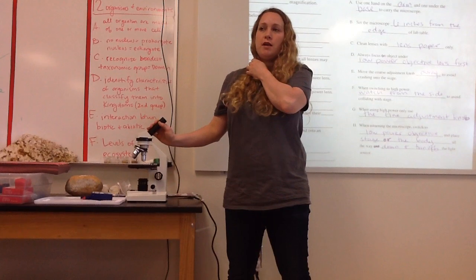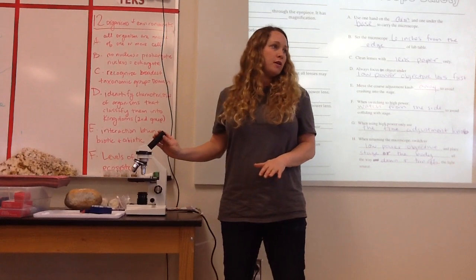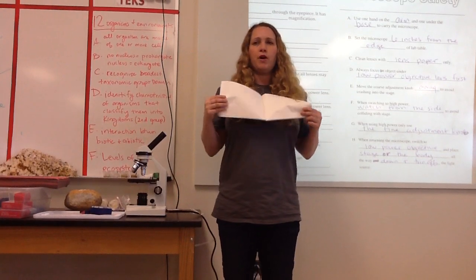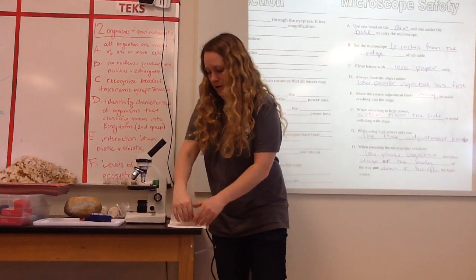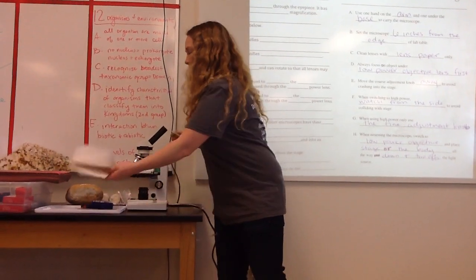Hundreds of scratches, and that'll interfere with your picture, and you won't be able to see the details on the slide because what you'll see is scratches. Does that make sense? Okay, so this is lens paper. It's kind of white like wax paper, but it has a special texture that will not scratch the glass. So what you do is you just get a little piece. See how thin it is? And you clean off by rubbing.